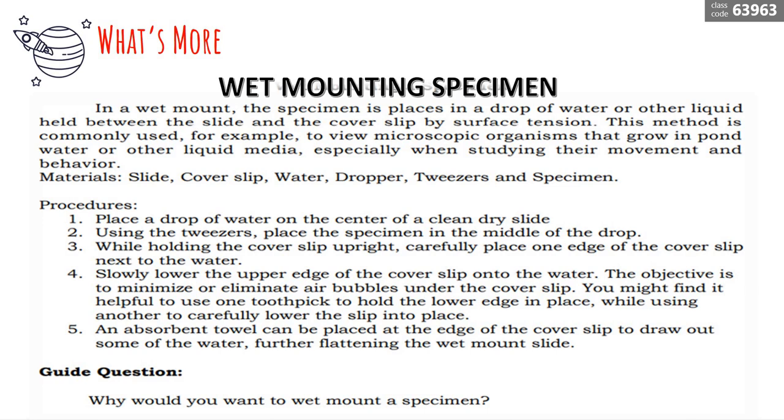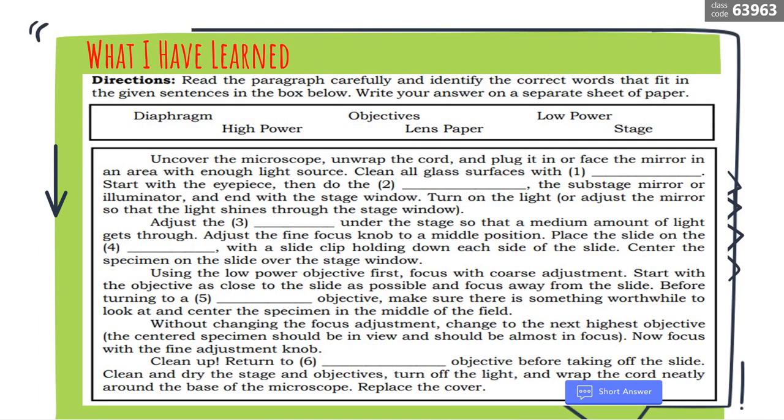So this is a guide question. Why would you want to wet mount the specimen? Answer this. Okay, so let's have this one.